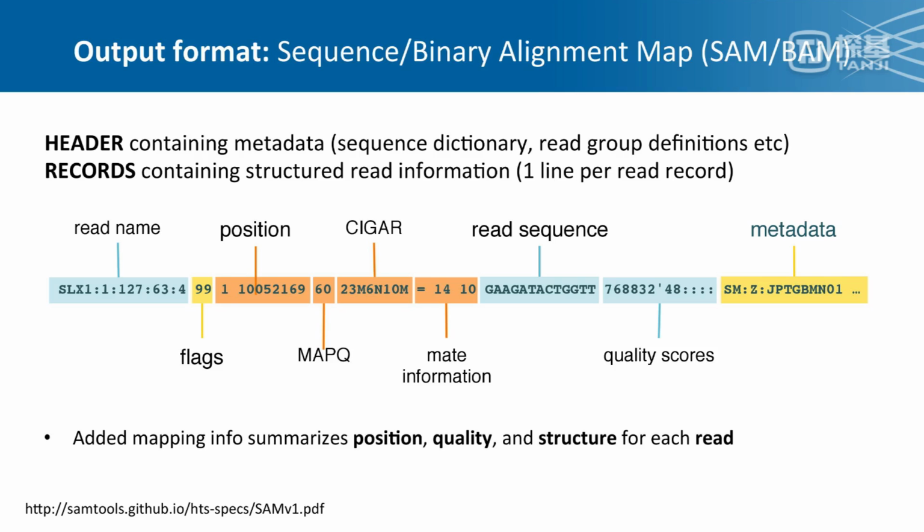And then it's got the actual sequence, some quality scores, and then this metadata at the end, which is very important for us because you can store an unstructured amount of metadata about your read, preserving the information that came with the sequencer and maybe some prep. And being able to store that additional information really helps for troubleshooting. And that's why we prefer this file format, so we'll talk a little bit more about that.